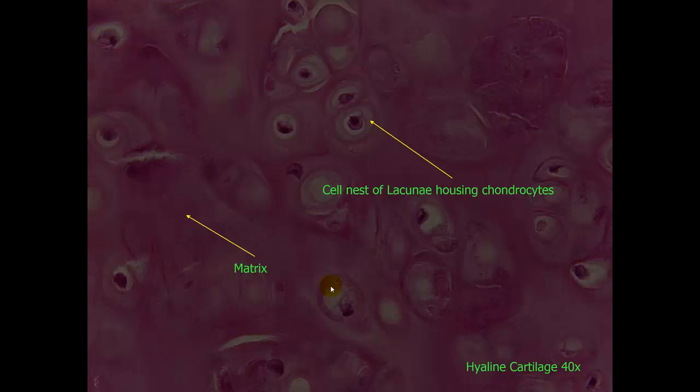Next slide is a higher magnification, 40x objective. Here is the matrix clearly seen in between the cell nests of lacunae that have the chondrocytes themselves. Pay attention to this matrix, because the differentiation between the hyaline cartilage and the elastic and fiber cartilage is what is contained in this matrix, in between these lacunae.